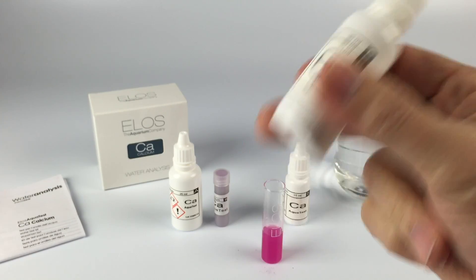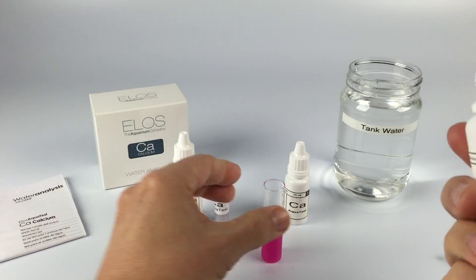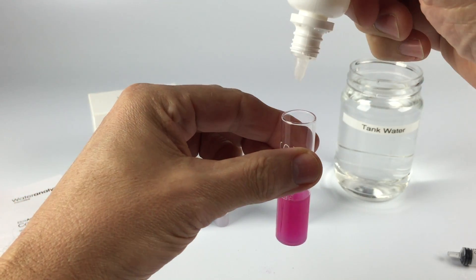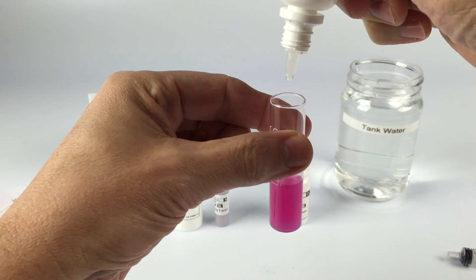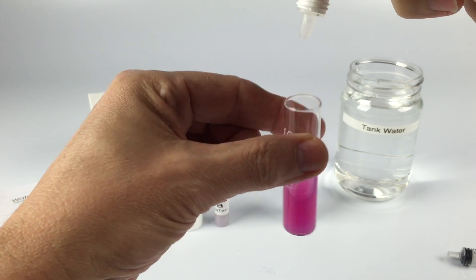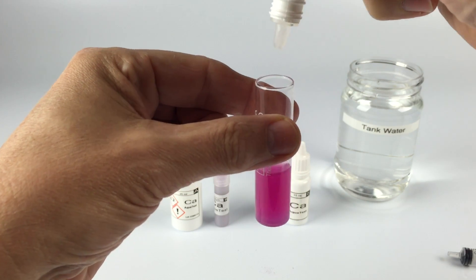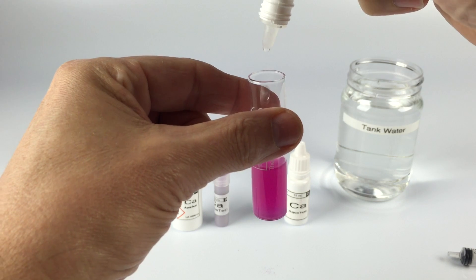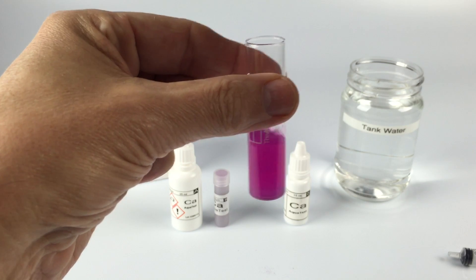Shake Part C for 15 seconds. Now we're going to add one drop at a time to change the color from pink to blue. Count the drops — don't lose track. Each drop represents 50 parts per million of calcium. 2, 3, 4, 5, 6 — it's getting close.